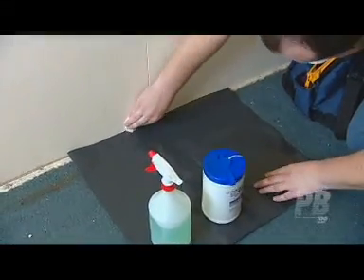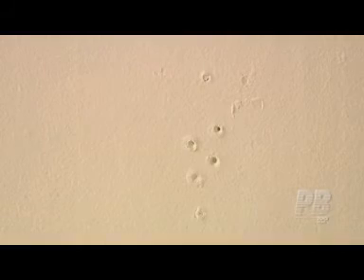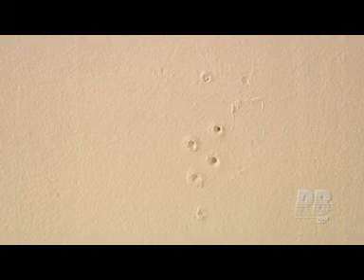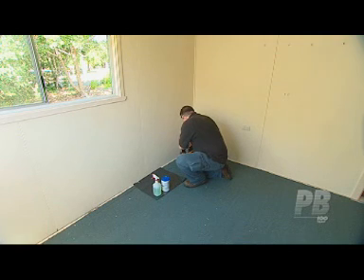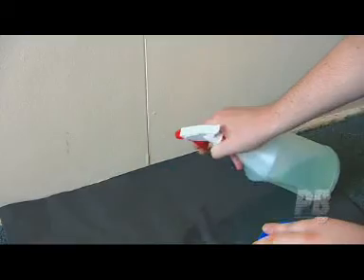First, make sure the area is clean before you take the sample. Try and find a sample site that already has some small damage, like an old screw hole. Take care to minimise the disturbance to the ACMs and any dust or debris that might be present. Prior to the collection of samples, the surface of the material to be sampled should be wet down with a spray bottle.